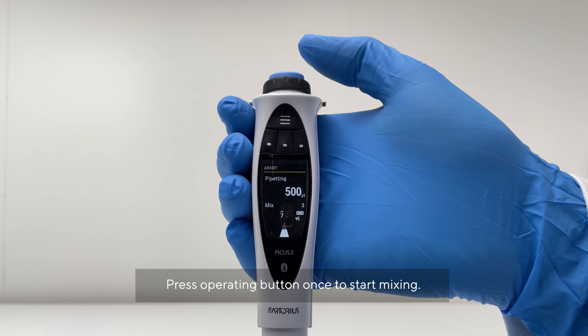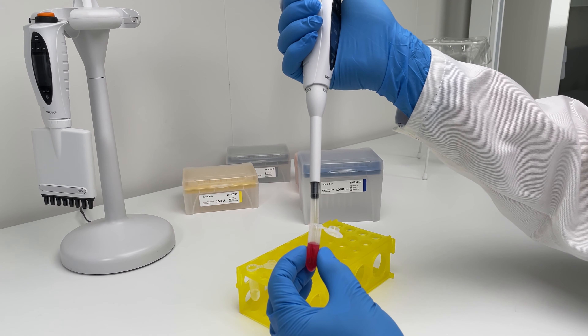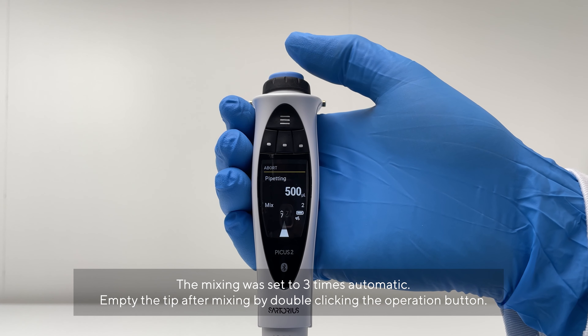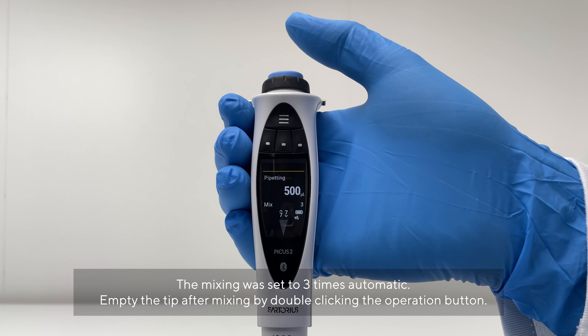Press the Operating button once to start mixing. The mixing was set to three times automatic. Empty the tip after mixing by double-clicking the Operating button.